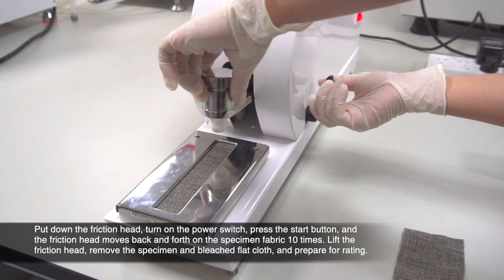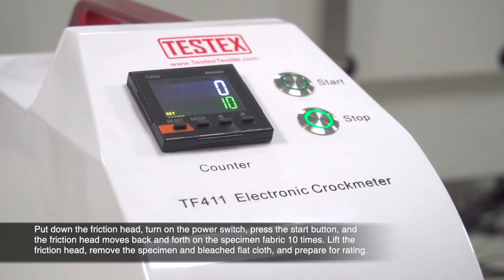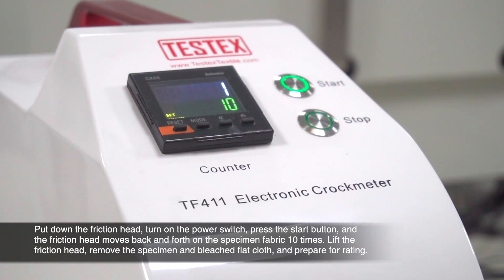Put down the friction head, turn on the power switch, press the start button and the friction head moves back and forth on the specimen fabric 10 times. Lift the friction head, remove the specimen and bleached flat cloth and prepare for rating.